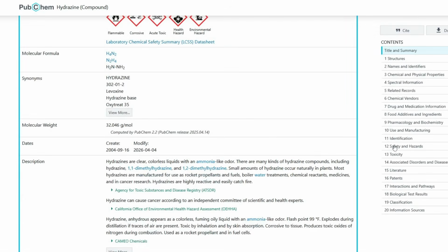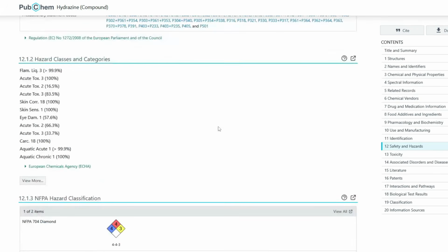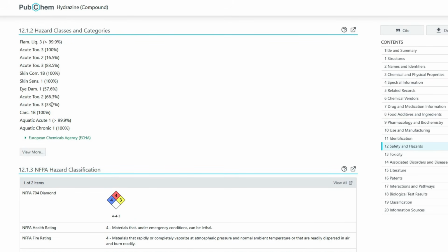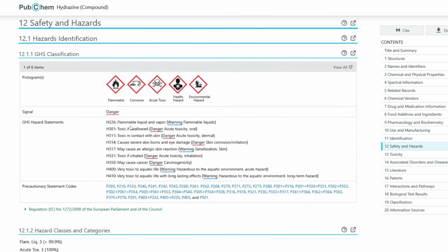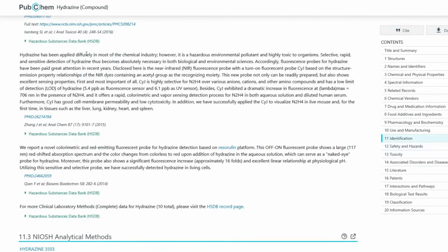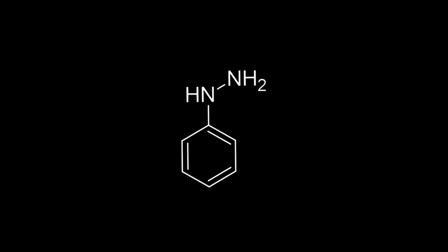If you dive a bit into hydrazine chemistry, one particular thing that seems to be true for most of its derivatives is their toxicity. Many hydrazine compounds are either quite acutely toxic or are even mutagenic and carcinogenic. That unsettling property is mostly due to the extraordinarily high reactivity of these compounds, and that is also why they are so useful in chemistry as well.